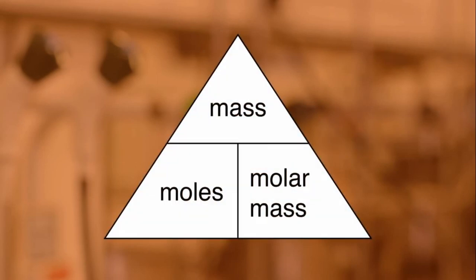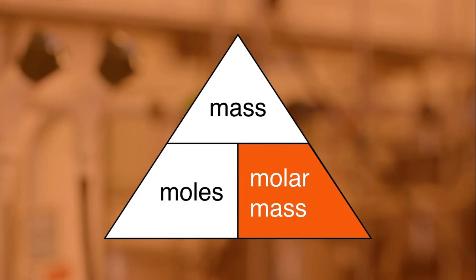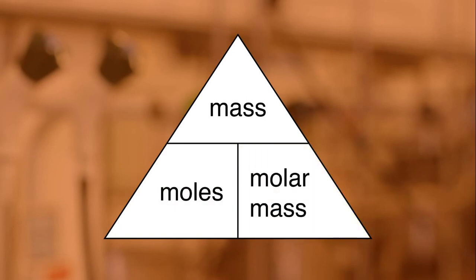Here the empirical formula has been calculated from a displacement reaction. The relationship between mass, moles and molar mass has been used. This is an important relationship to remember.